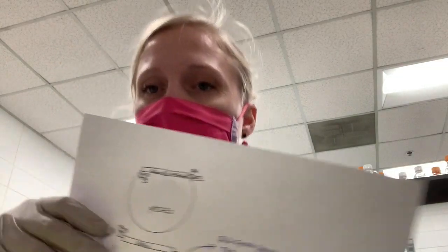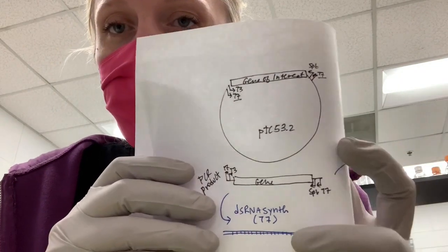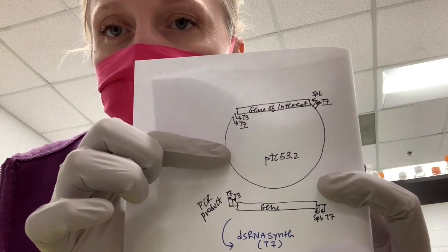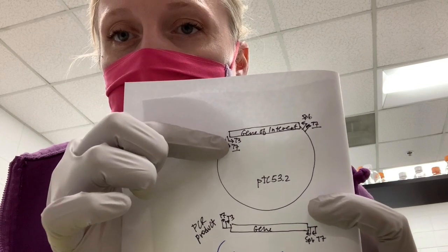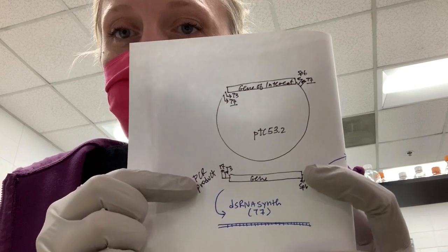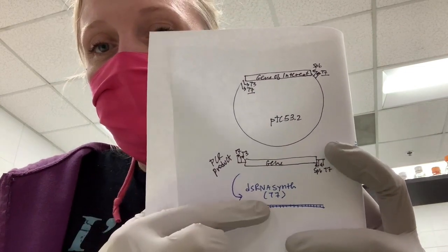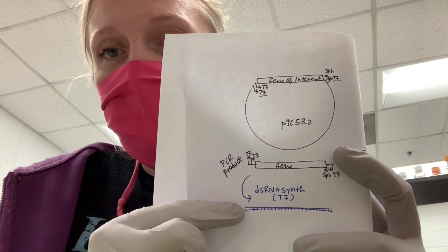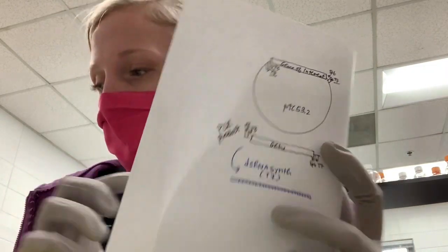So going back to what we talked about when we did this PCR, you have your PJC 53.2 plasmid. We've amplified from the T7 promoter to the T7 promoter using those T7 primers to make this PCR product. And what we're going to do now is use the T7 enzyme to generate double-stranded RNA from this PCR product. So the input is the purified PCR product from Hot Start, and that's what we're going to use as the starting material.